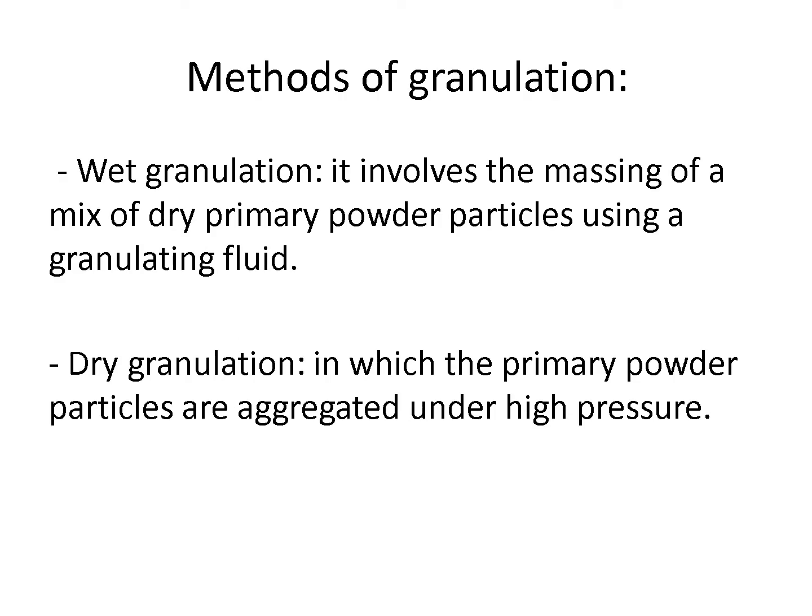As we said, we have two methods of granulation: wet granulation technique, as we will do in our lab. Watch the video please. We will gather the fine powder, we will form a binding liquid, I call it glue. We will add binder as a powder in water and form starch mucilage. We will add the optimum amount of that liquid into the powder, forming a mass or dough.